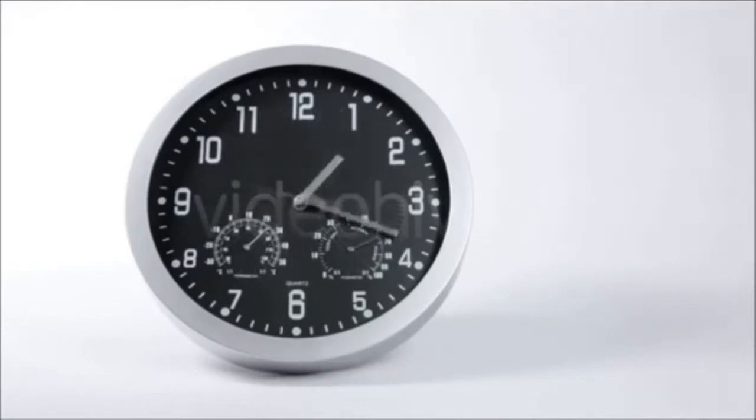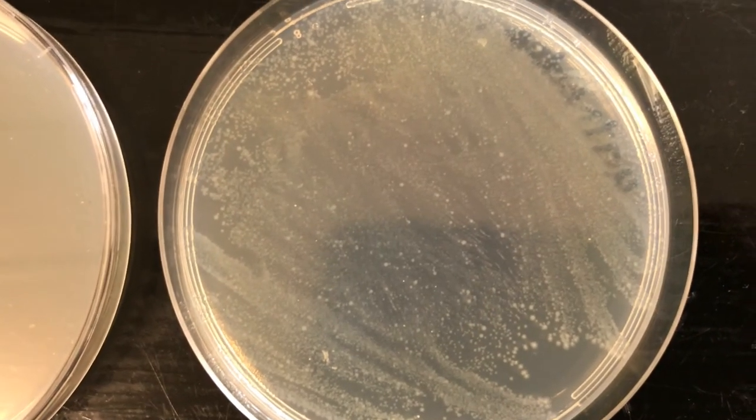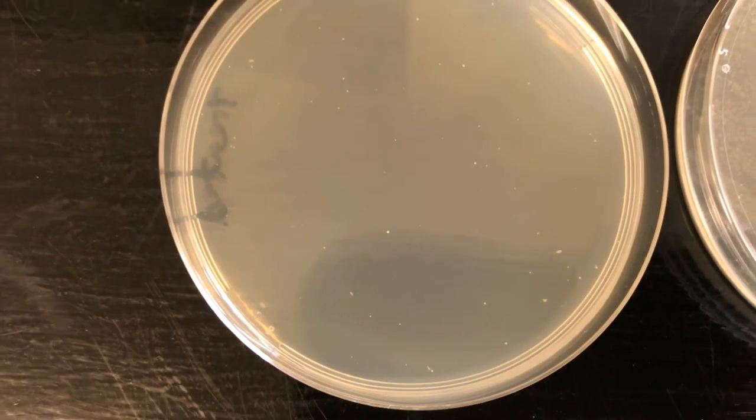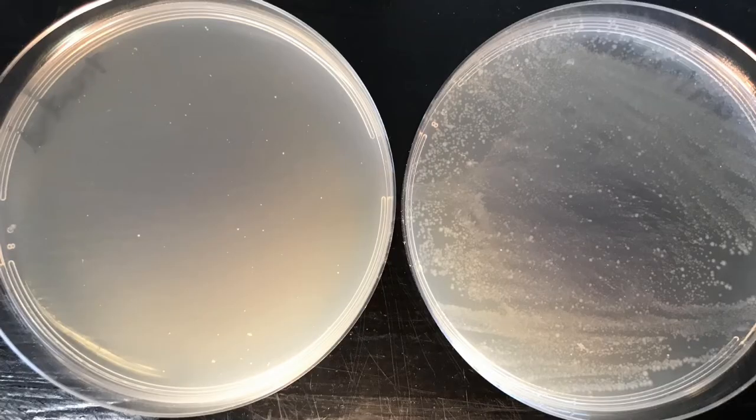We've left the agar plates in there for just over 48 hours. You can see here: the first agar plate is the untreated, the second is the treated. There is a huge difference in the amount of E. coli that has grown. There are a couple of white specks on the treated plate — I'm not sure whether that's a little E. coli that survived or just contamination from the air. We probably should have done a third agar plate left open to the air as a control. The agar plates weren't kept airtight, so there could be some air contamination, but there is a huge, huge difference in what grew on those two plates.